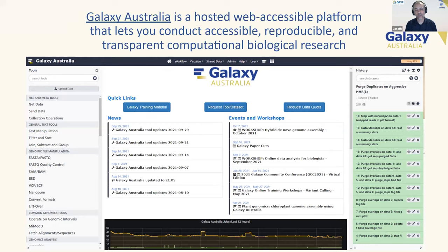Well, at the surface of it, it's a website, but really that is just the interface to a huge number of backend resources, huge number of tools, large amount of compute and large amount of references, all wrapped up in a way that really does allow you to do reproducible science. So we're just showing here a screenshot of the landing page with your data processing on the right-hand side, the tool list on the left-hand side, and an interactive window in the middle.